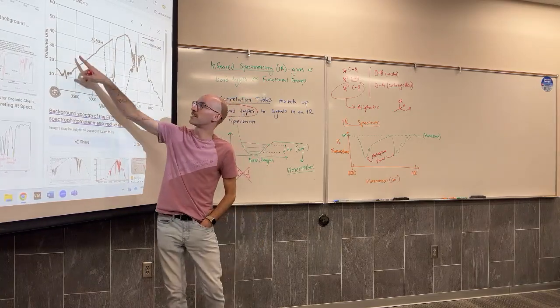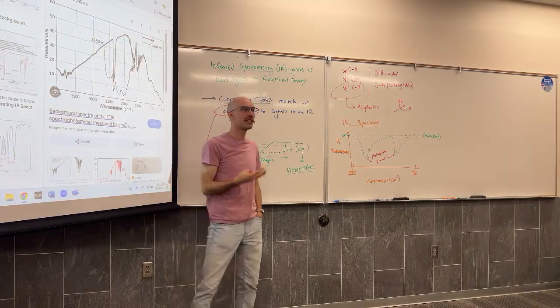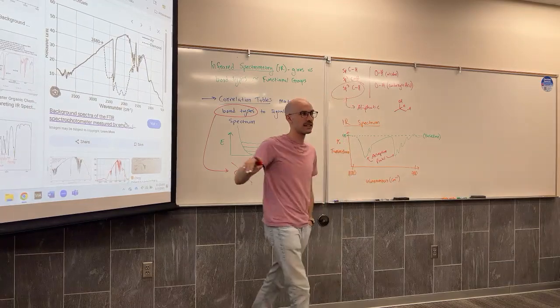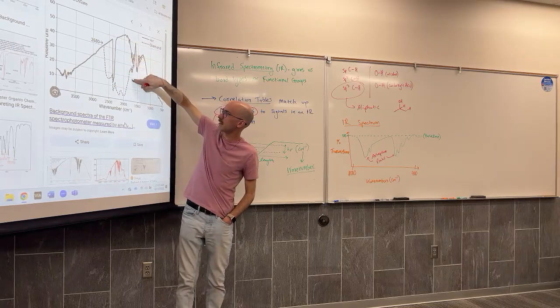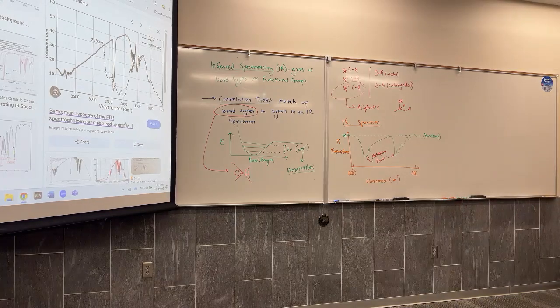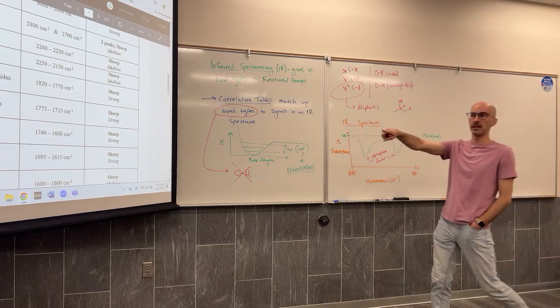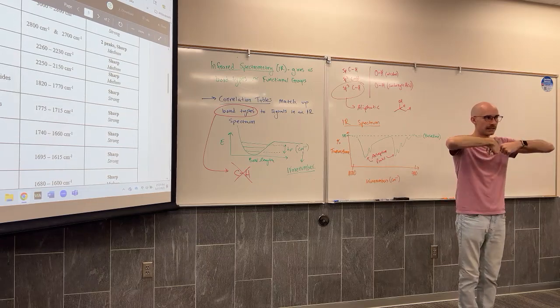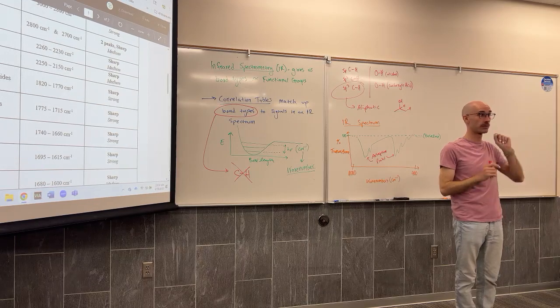If you look at this high frequency region, you can see that a lot of light is being absorbed. That's mostly from water. If you get too close to your infrared spectrometer and you breathe on it, you'll see this peak intensify. And then there's this other peak here and here, usually credited to carbon dioxide. Carbon dioxide is much like a carbonyl. It's got that CO double bond. And when carbon dioxide bends from linear to bent, it changes its dipole moment, so it absorbs very well.